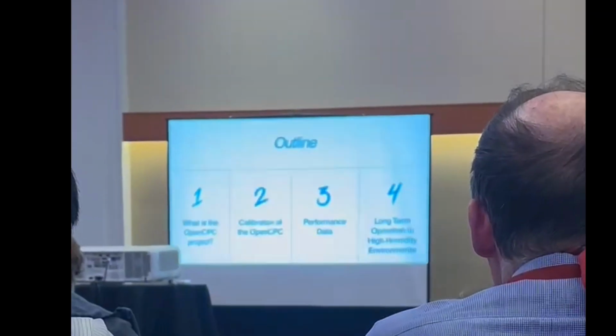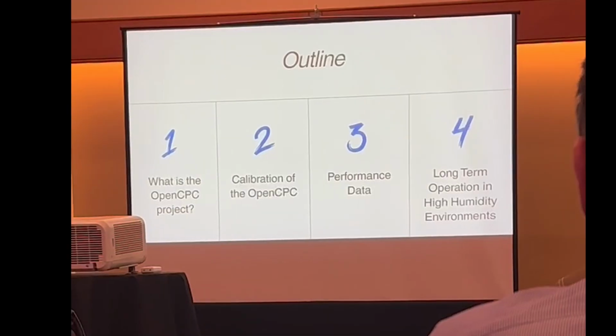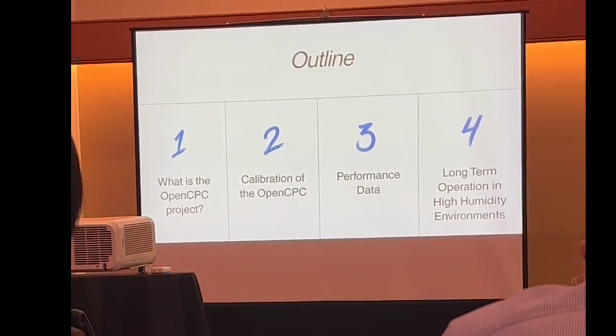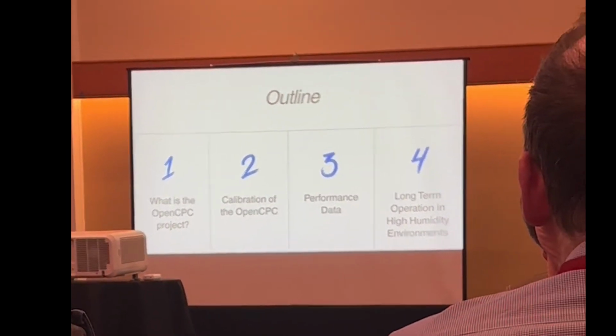So we're going to talk through a little bit about what the OpenCPC project is, talk about how we calibrate the OpenCPC. It's a little different than a traditional CPC. Go through some performance data, and talk about long-term operation in high humidity environments, which is kind of interesting given the working fluid we're using.